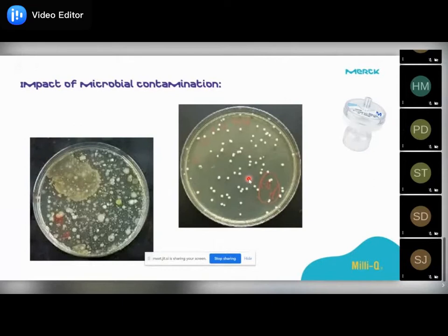This is only a small example in terms of whenever you are working on microbiology. Similarly, molecular biology and molecular diagnosis was a major area of work for today. Even for analytical applications, or any application you name, there will be very different problems you may get, and all of that may come from the water.